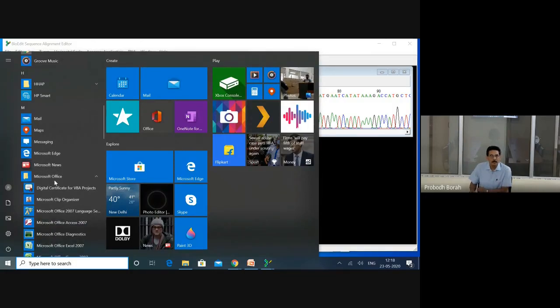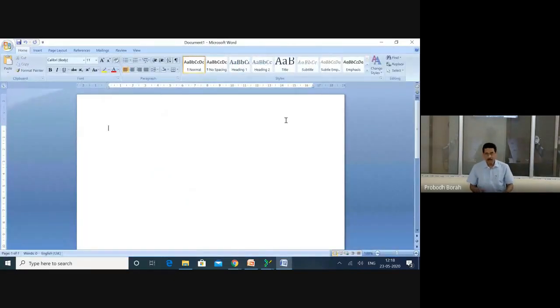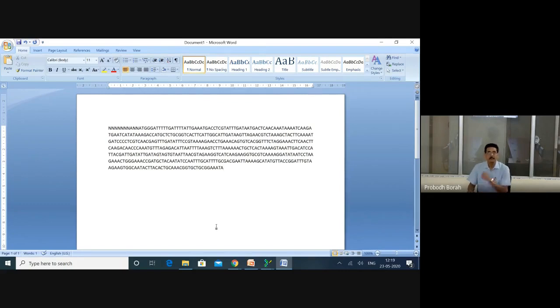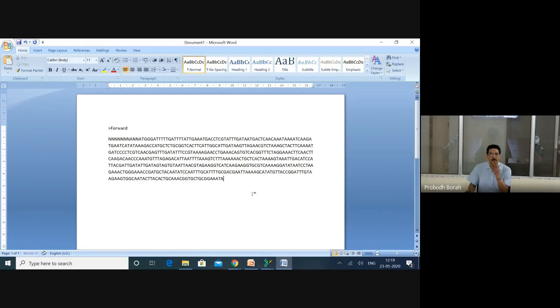Open Microsoft Word. In the Word file, paste the sequence - the sequence is already in memory from copying. Either right-click and paste or press Ctrl+V. This is the raw sequence that we have obtained. We know it is the forward sequence. Go to the beginning of the sequence, press Enter to bring it down, and write '>forward' in FASTA format so you can remember this is the forward sequence.